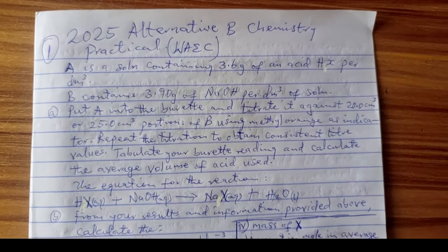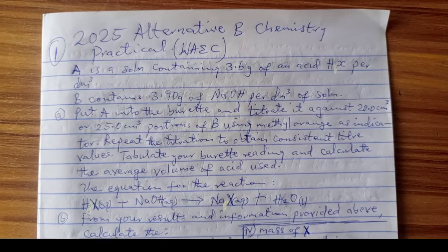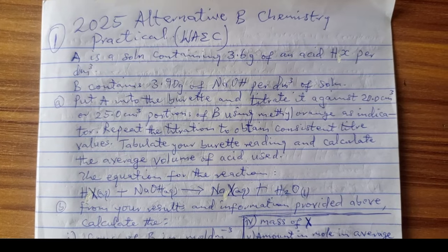Now, question 1 is always titration, as you know. Question 2 is always about qualitative analysis. Question 3 is a general question. Now, let's see the question 1 that we have in our class today.